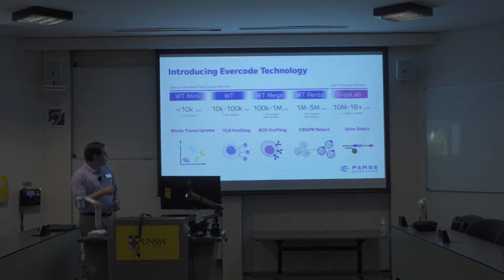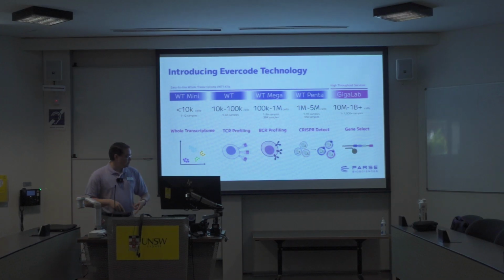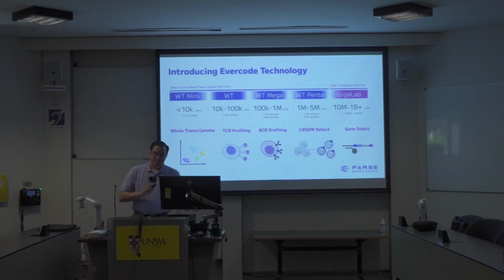The basis of the technology is the whole transcriptome, but you can also add TCR, BCR, crop-seq CRISPR screens, or gene pull-downs, and I'll talk about these two specifically in a little bit.